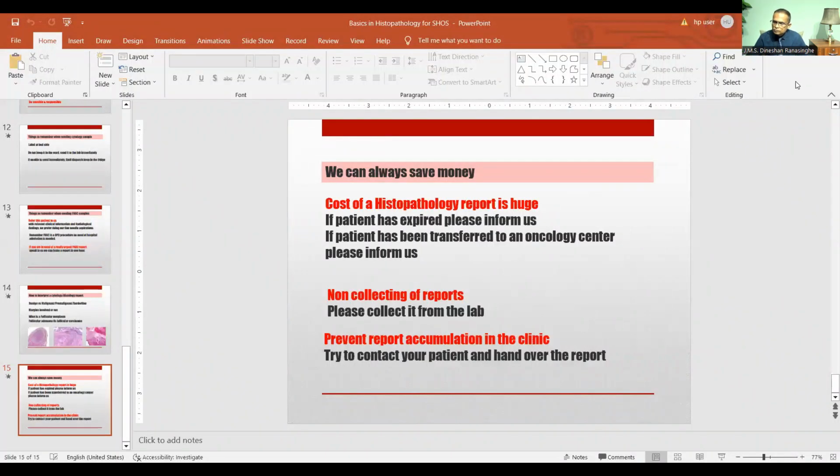So there are a few questions about pap smear preparation and also about transferring the pap smears from the ward to the lab. What are the antiseptics that we can use, or is there a necessity of using antiseptic when doing pap smears? Is one question. And another question is, how must the pap smear samples be sent to the lab? There are two parts in that question, I suppose.